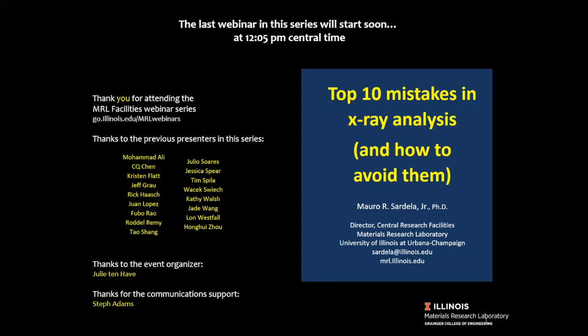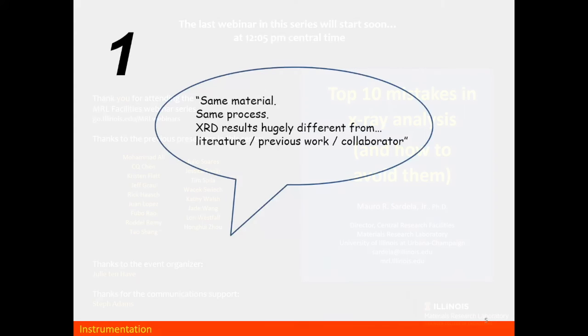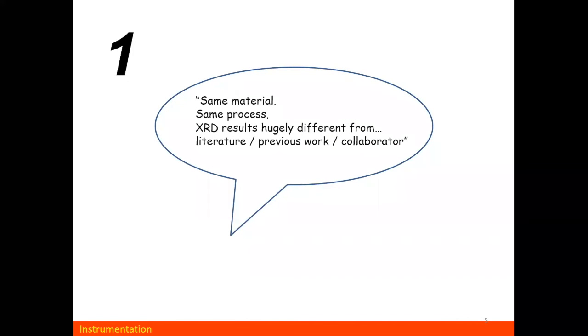This webinar is going to have a little bit different orientation. We're going to do the whole thing upside down or backwards, because we'll start with data that has a problem. Then we'll bring in the theory or the basic concepts of how to understand that. And then we'll show you how to provide the correction for the original problem. We'll follow a sequence of complexity.